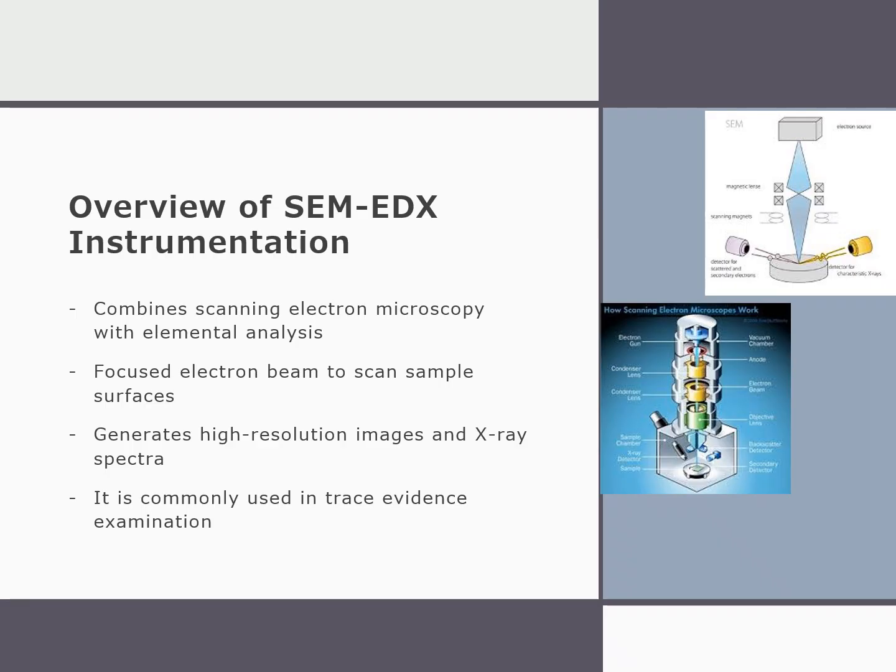Overview of SEM-EDX instrumentation. SEM-EDX integrates two technologies into one platform. The SEM generates high-resolution surface images by scanning the sample with a focused electron beam.